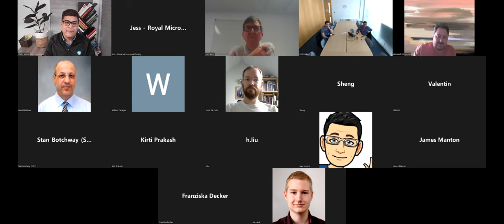Maybe Shalin, I will ask one last quick question. Since you have a background in super resolution imaging also, I was wondering if you are trying to integrate these methods. And one slightly related question: I know this company Nanolive, which produces a lot of fantastic label-free images, but they are slightly different in concept. How do you see integrating that also?